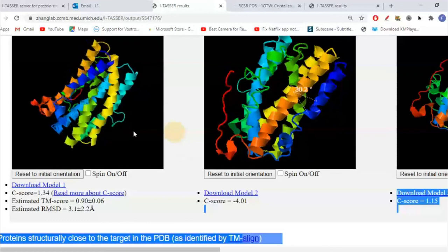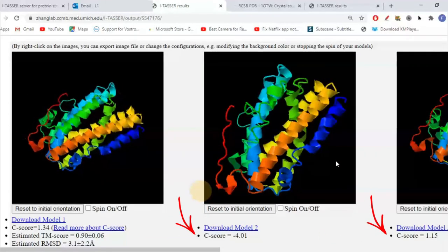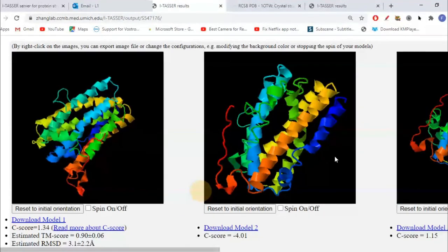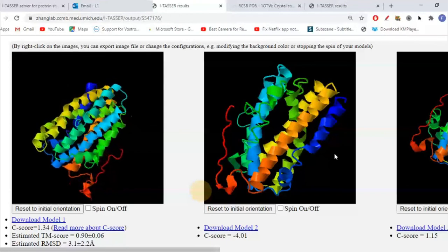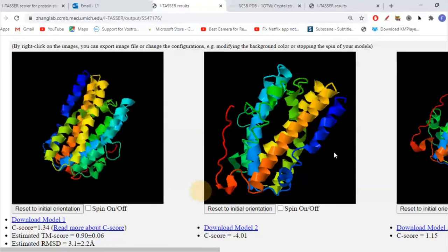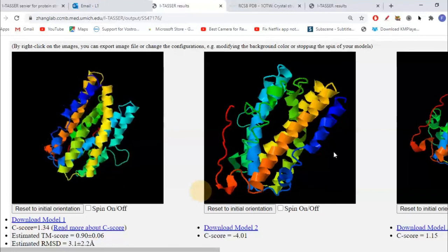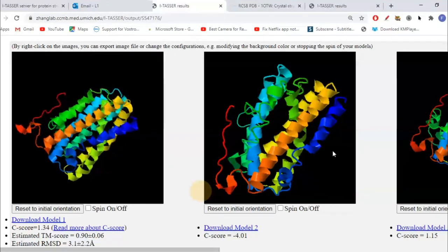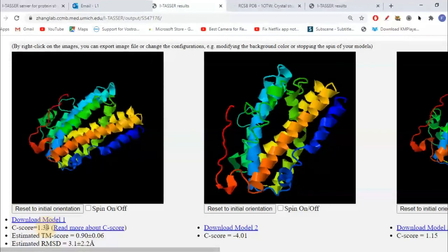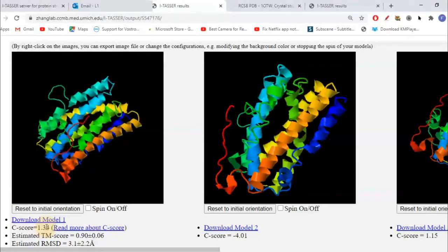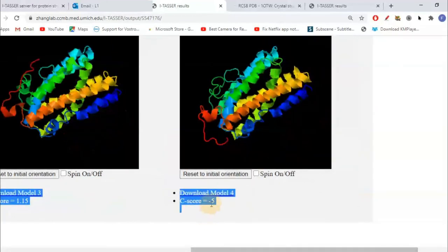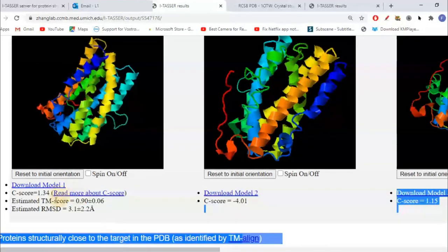The C-score is quite important here. It usually ranges between minus five and two. If the C-score is positive, we can rely on the structure — it means our predicted structure is quite close to the actual structure. We should follow the positive ones. The most reliable structure is the one with a positive value close to two. You can see here some structures have values like minus four or minus five — those won't be that reliable. The positive ones are more reliable.